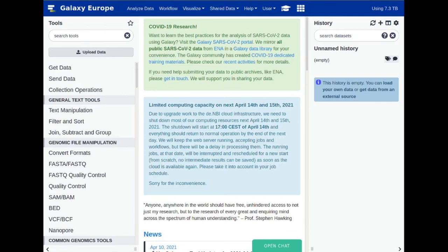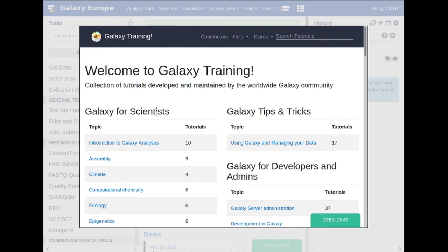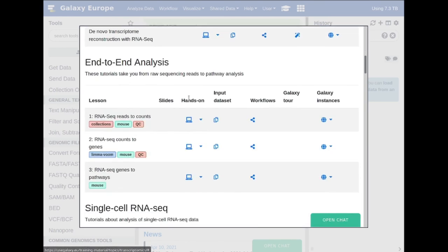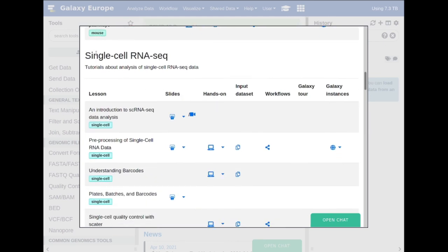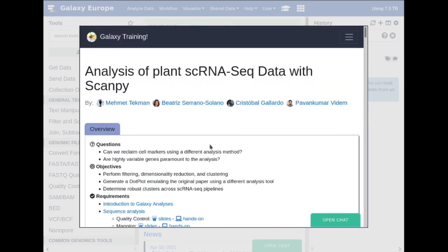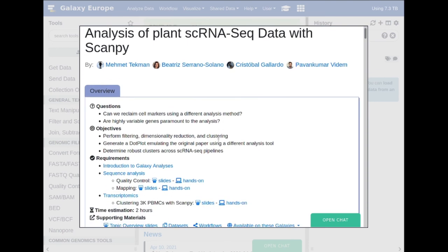Hello everybody and welcome to the single cell plants dataset tutorial, where we will be going through the tutorial given under transcriptomics. If you scroll down to the single cell section, it is the analysis of plant scRNA-seq data with scampi. Click on the 'Follow the Tutorial' button here and it launches the tutorial we will be doing today.